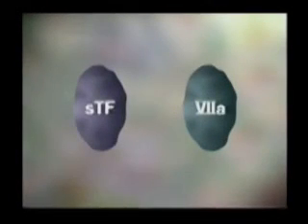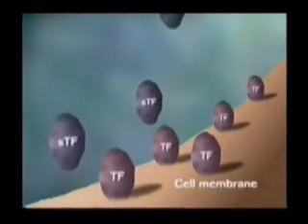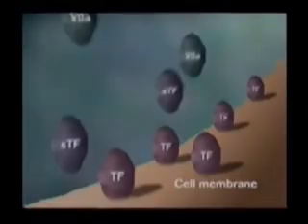The sedimentation velocity run reveals that 7A and STF are both rather asymmetric. Interestingly, the length of the complex is greater than the length of either molecule alone. This implies that the 2 elliptical particles do not bind side by side, but instead overlap for part of their lengths. As we'll see, the physical shape of the complex holds implications for its operation in the bloodstream.